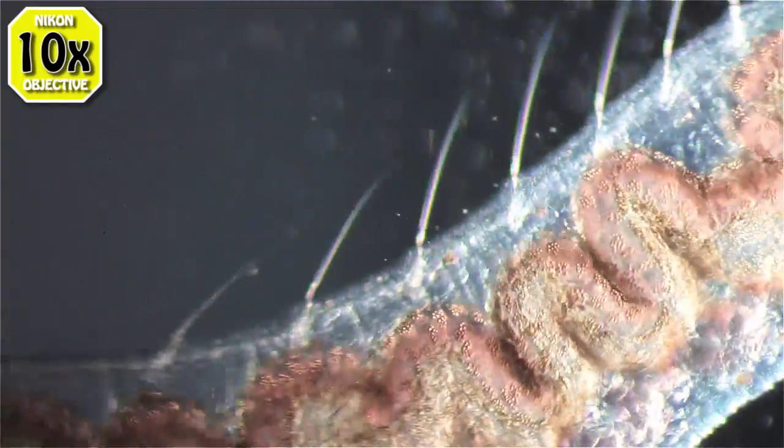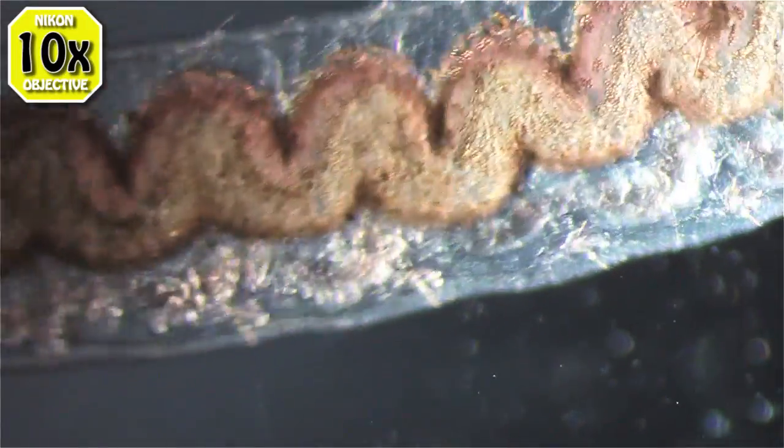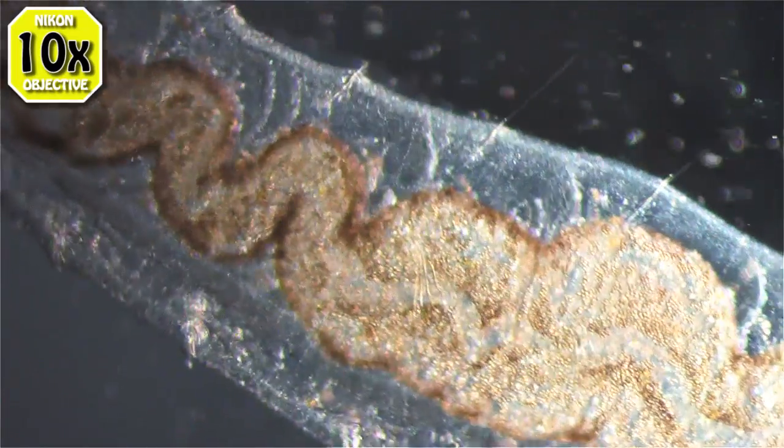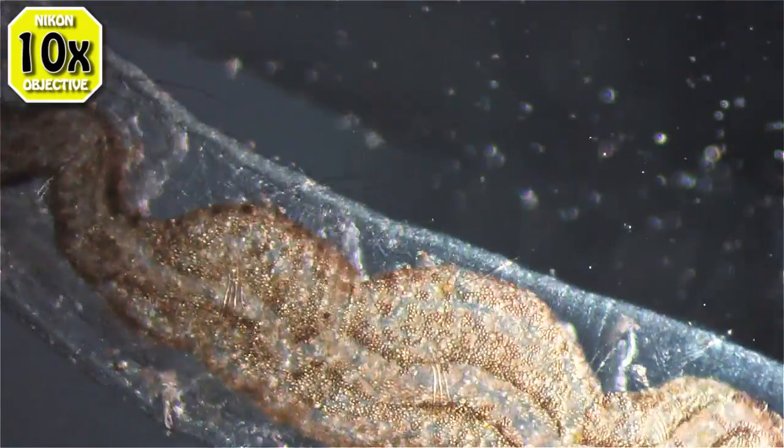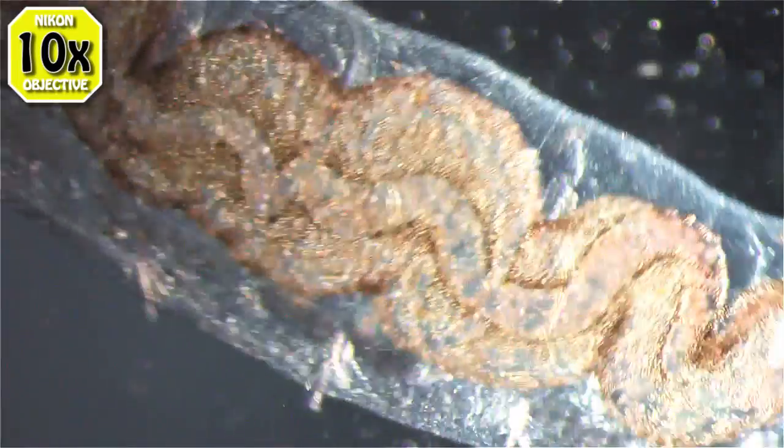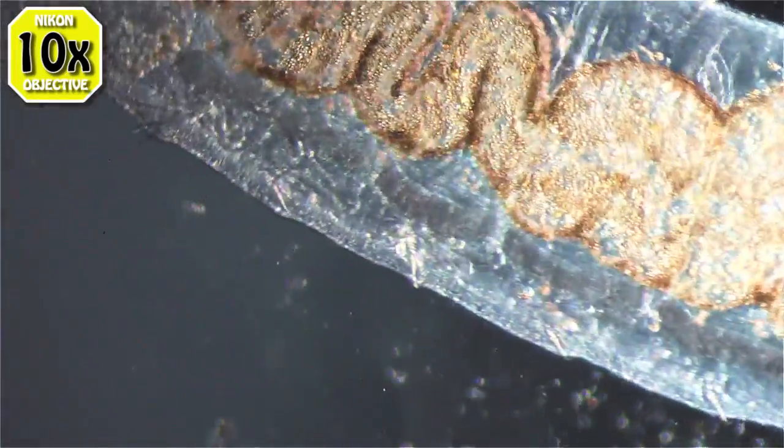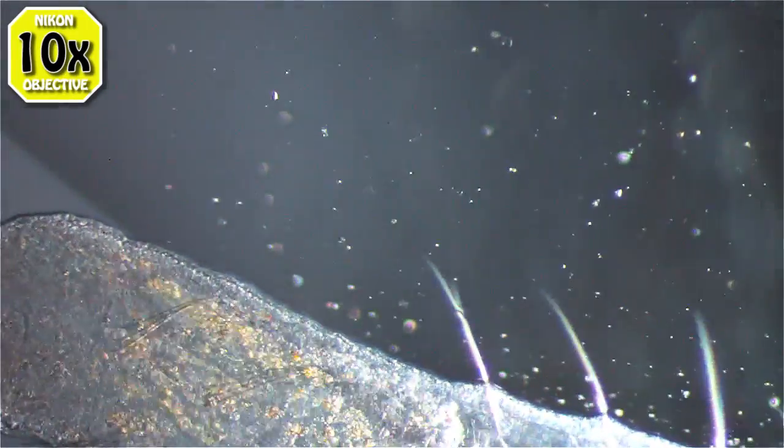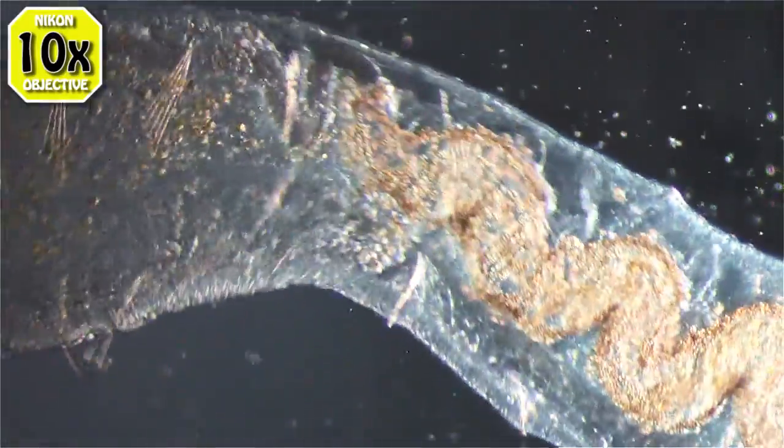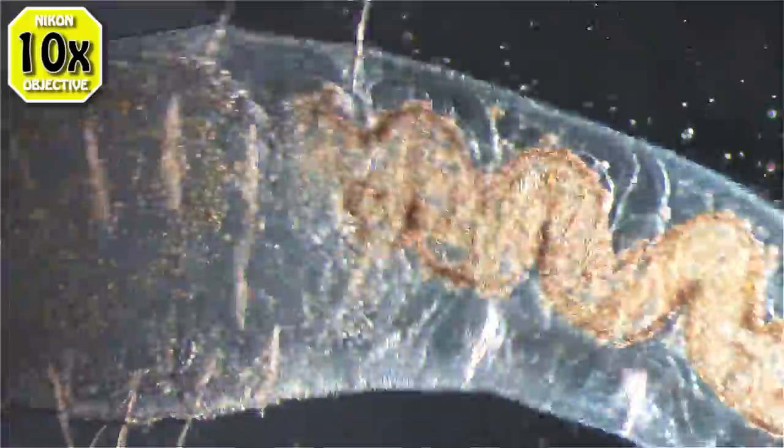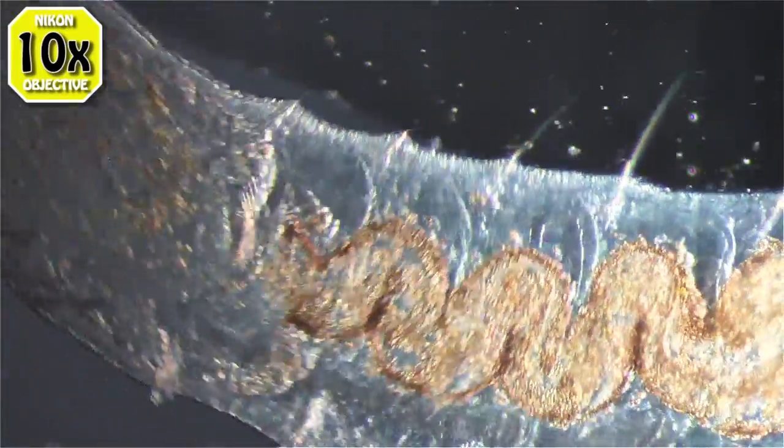I don't know what this part is, possibly the stomach or something similar. Some sort of an organ. And here we are at the head. See he doesn't pull away from the light as fast this time. You can see right there where his throat starts.